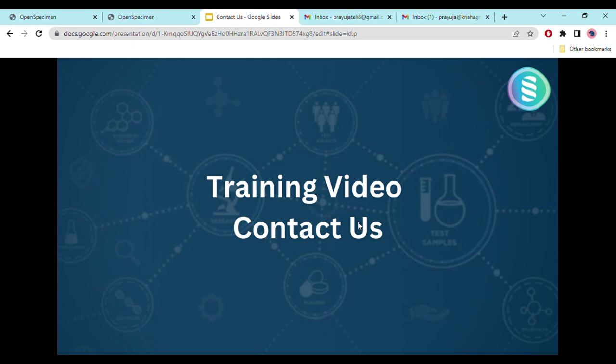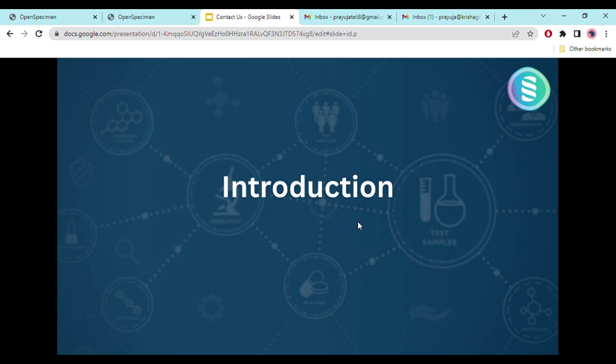In this video, we'll see the contact us feature. The contact us feature allows Biobank to create a contact us form on the login screen. This can be used by the public to contact the Biobank for new projects, user training requests, or even general queries on data or anything, etc.